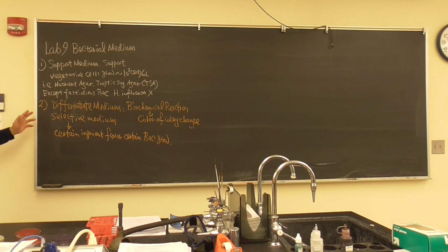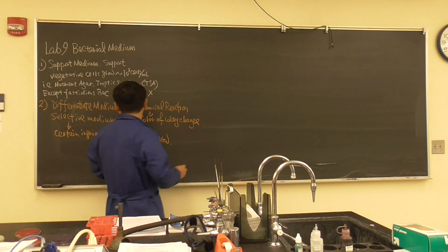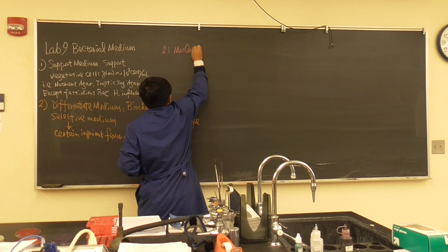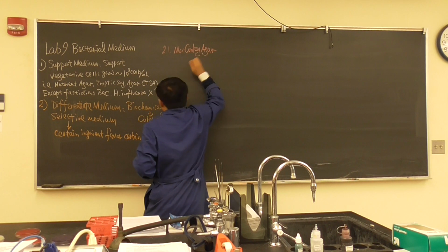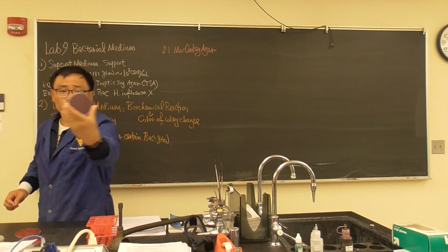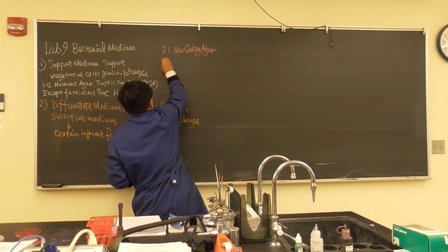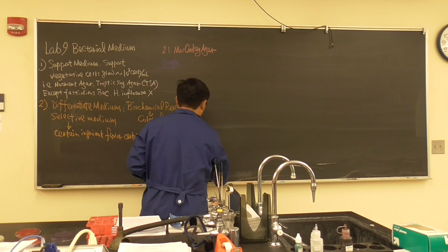So these are combined. Therefore, we come out with a bacteria called MacConkey agar. So this is a MacConkey agar. And you look at the MacConkey agar, it is very purple. The first impression, it is purple. I know you won't see, but I'll just write like this, purple.